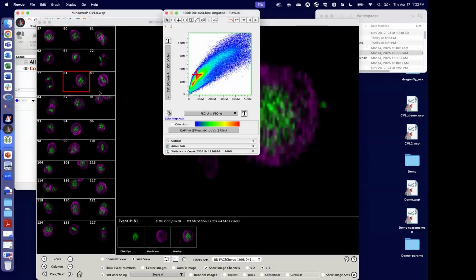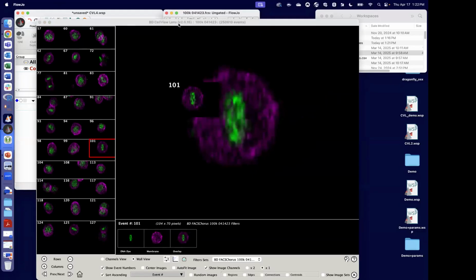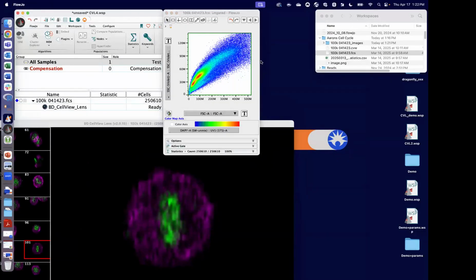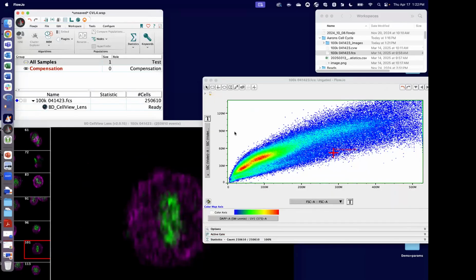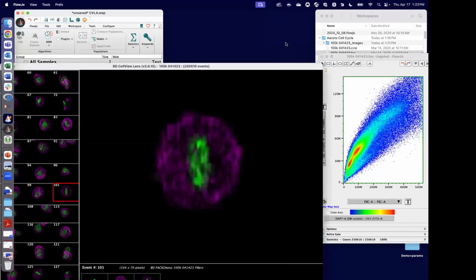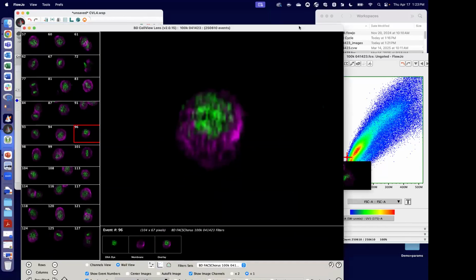This works in reverse also. You can click on a particular event and it pops up on that graph, which is behind this picture now. So let me move that. All right. And it is stuck behind my zoom control. So let me stretch it, then move it. Sorry for the enormous graph. Okay. And it'll work a little better if it's on the side. And I can just click and we can watch where the cross goes.